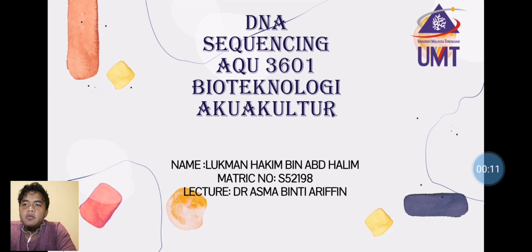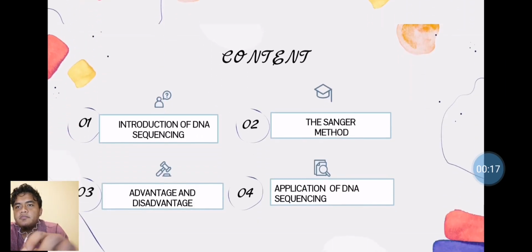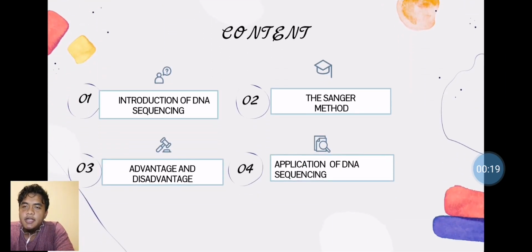So today I want to present about DNA sequencing. In this slide, I have four contents: introduction of DNA sequencing, the Sanger method, disadvantages and advantages of the Sanger method, and application of DNA sequencing.